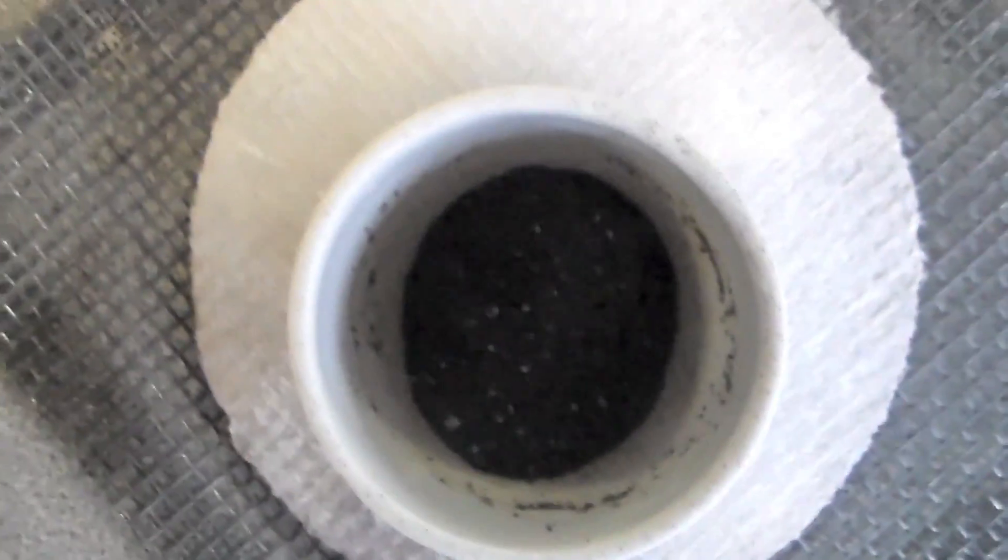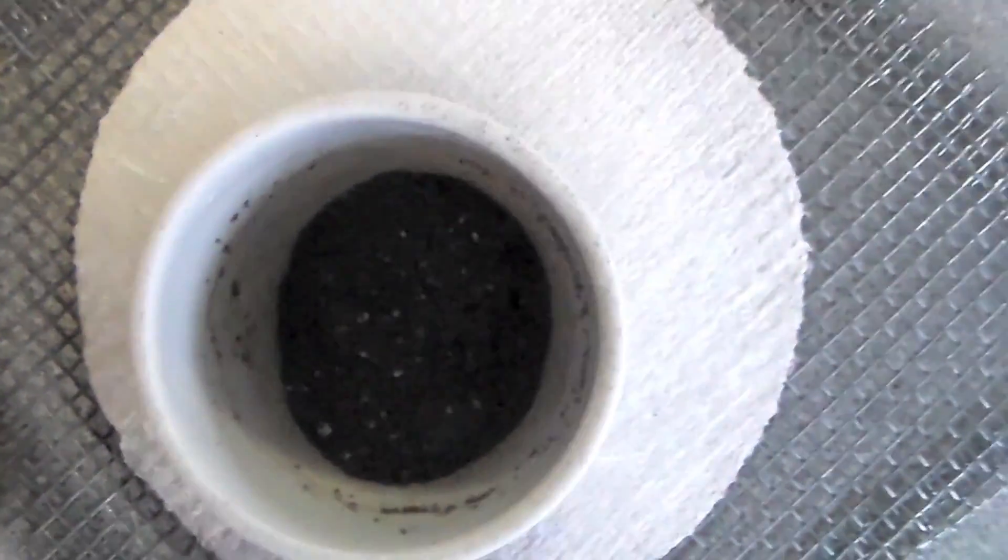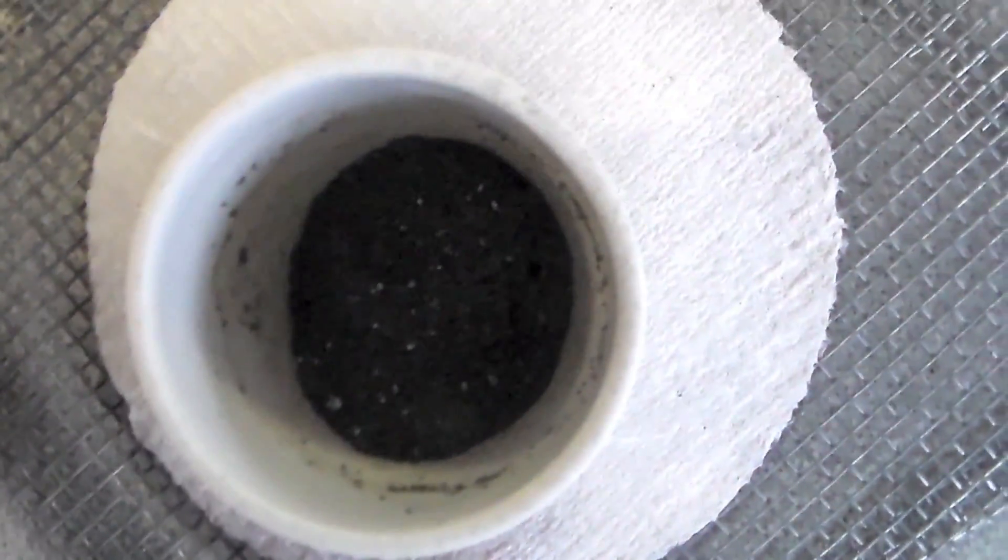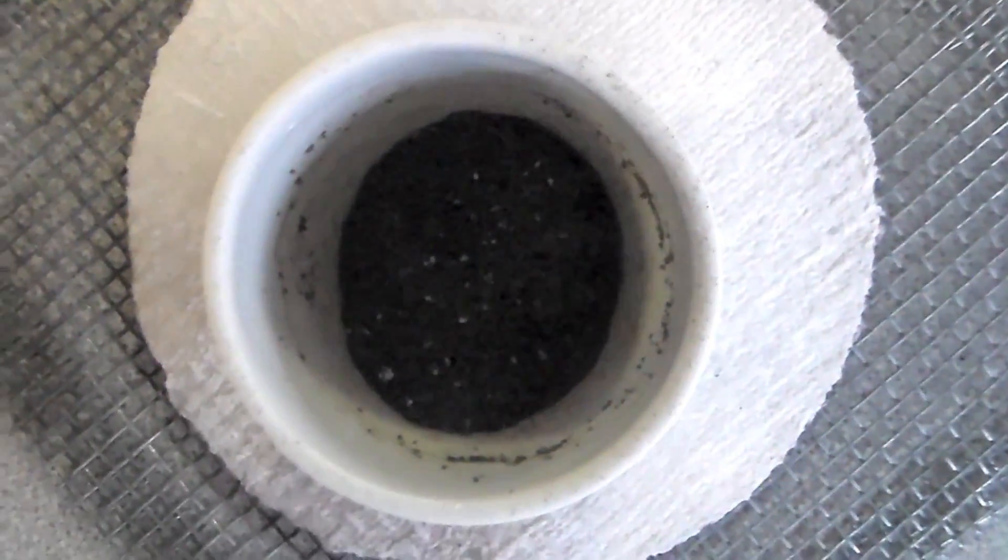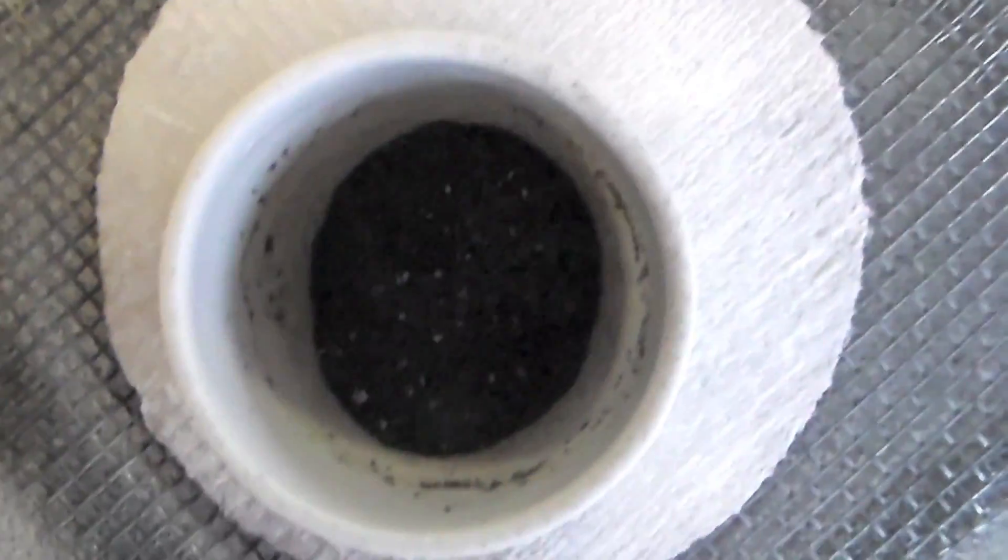It is obvious that it is impure because of the over 100 percent yield, and also there are a bunch of white flakes mixed in with the black powder. This is most likely unreacted sand. Now I'm not worried about removing the sand because it shouldn't affect the synthesis of silicon tetrachloride.